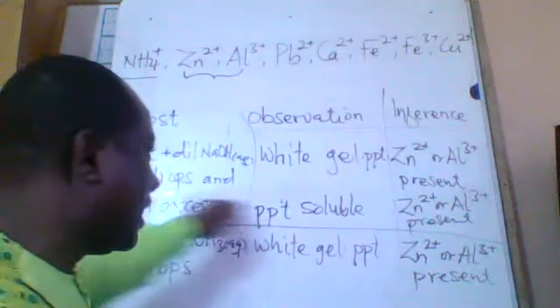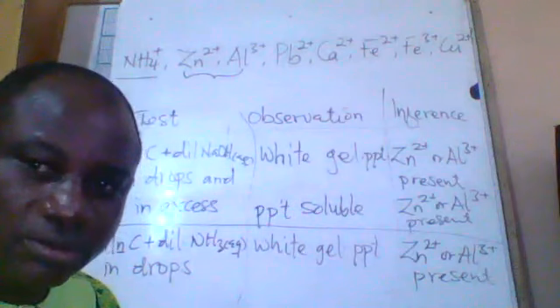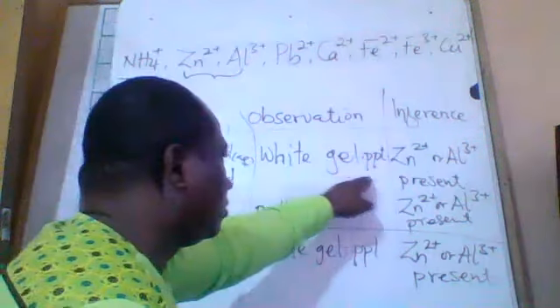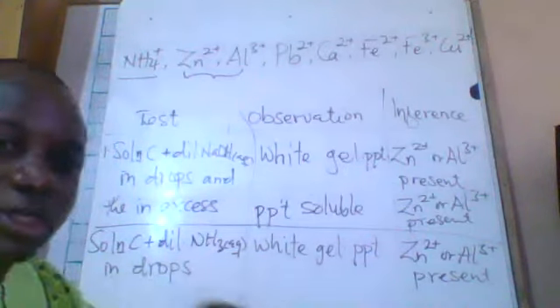So it will still just be in line with the SS. Are you getting it? Because the examiner should read the thing to make meaning out of it. You should know that in drops, this is the observation. In SS, this is the observation, and this is the conclusion. So it should be at par, it should be in line.